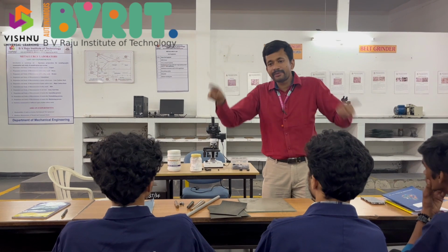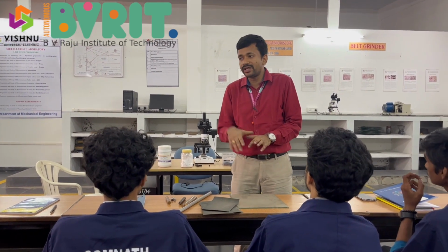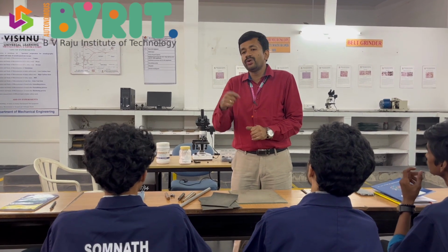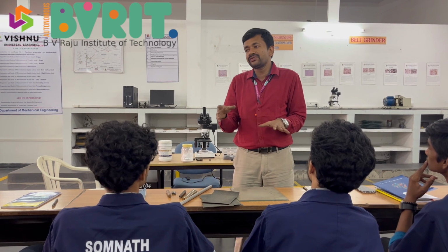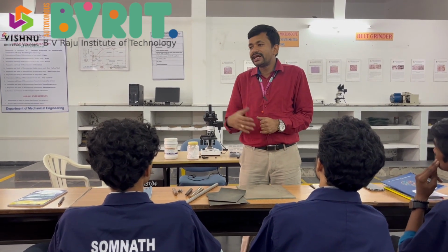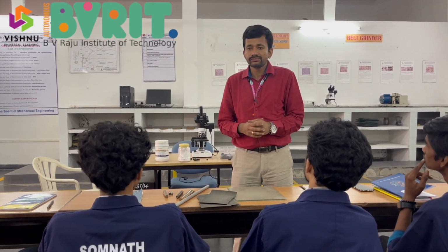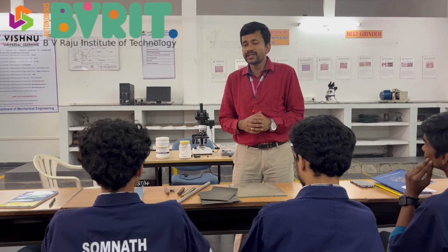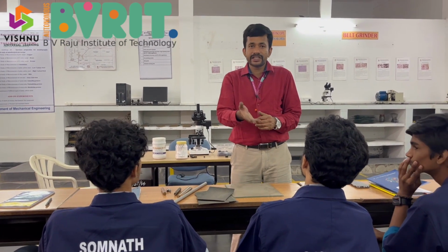This entire process you need to repeat in order to see the microstructure. Once you see the microstructure, you can note it down, and we have standard structures for different specimens, and that's how we will identify them, and that's what we note. Understood? Yes, sir. Is it clear for all? Yes, sir. So I'll explain the next part a little bit.